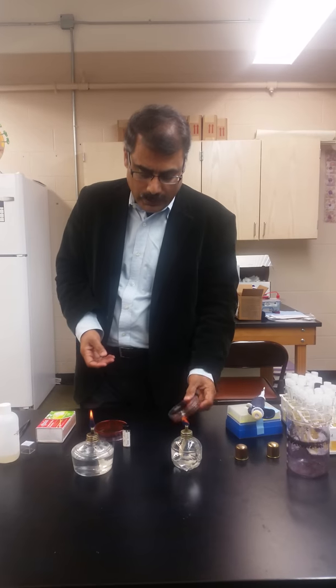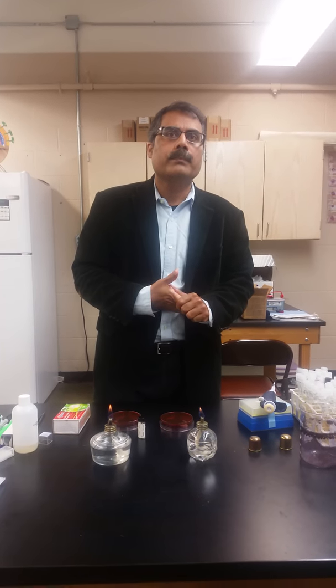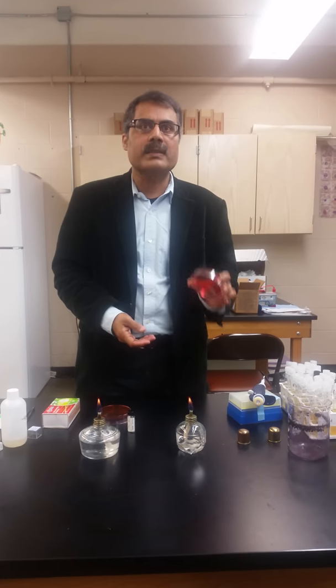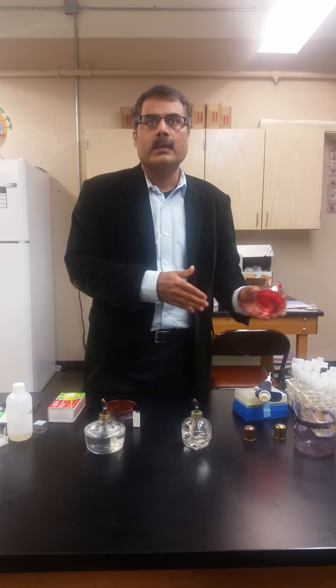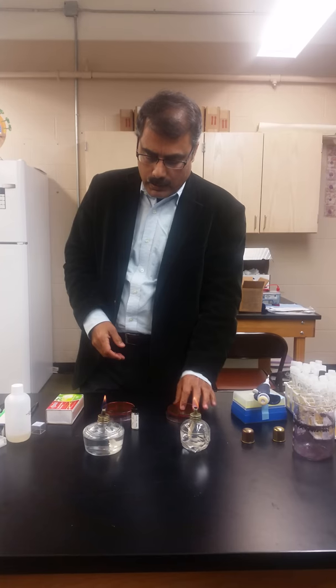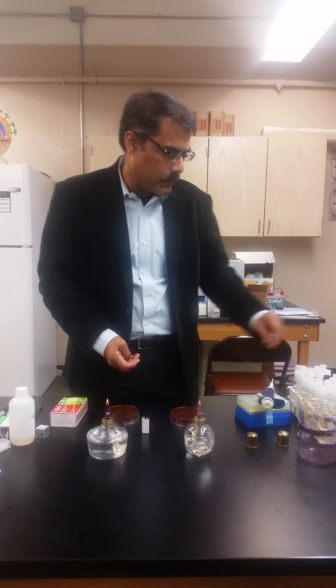But if you have a mixture and you want to get bacteria from that mixture, then you have to use some selective media so that one group is inhibited and the other group can grow on it, and then you can check them whether they are sensitive to something or not.